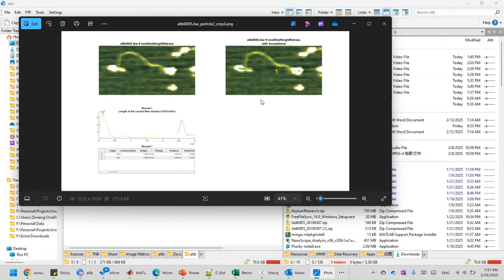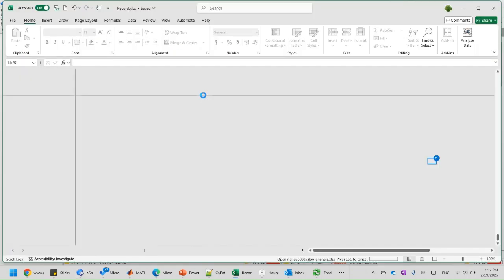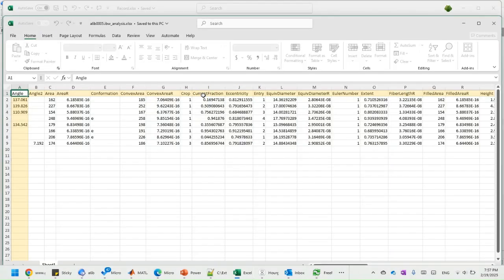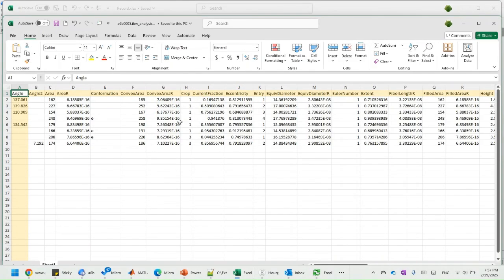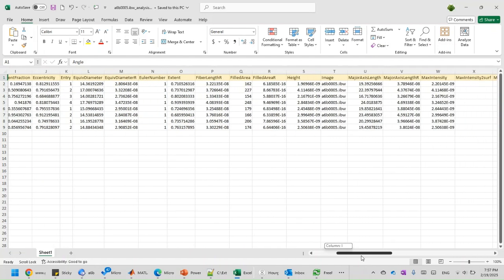So that looks good. And then we can go back to our Excel file again and see the result. You don't have to do this every time. I just only do this after I finish all my analysis, basically. Maybe I'll check it once in a while, but just remember to close that file. So right now I see if my measurements are recorded into this file or not.